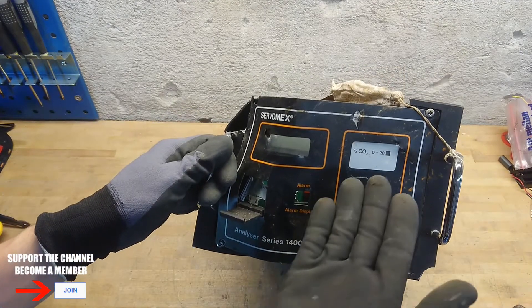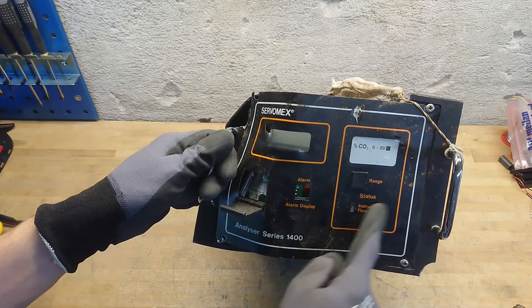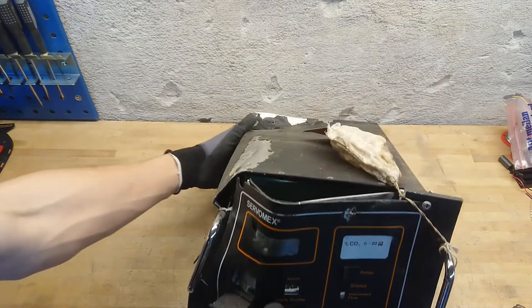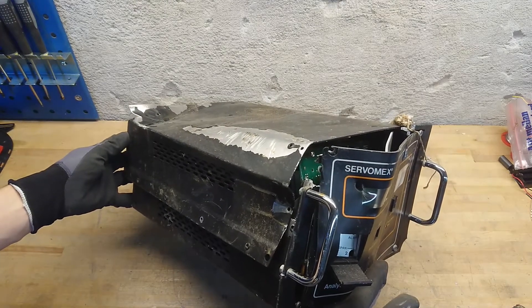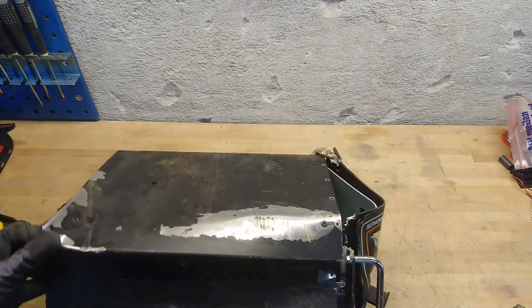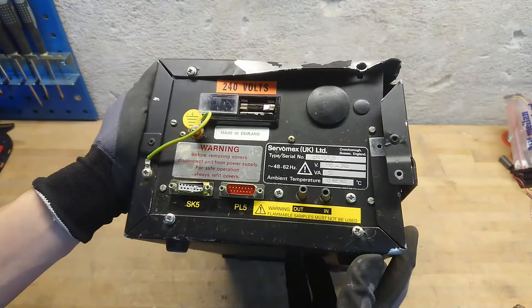It is a CO2 analyzer, percent-wise 0 to 20 percent. I'm not quite sure about the range or what this instrument really does, but from the look of it, this was not treated nicely at the scrapyard. It took a serious beating, but it seems that most of the electronics is intact, so at least we can take a look at that.